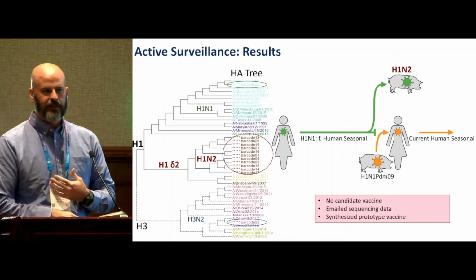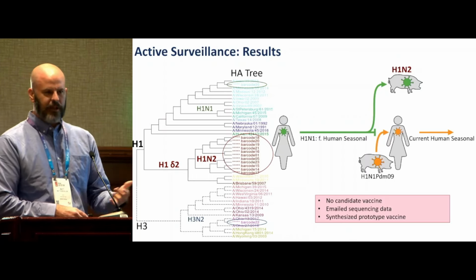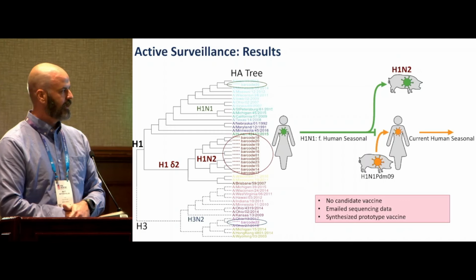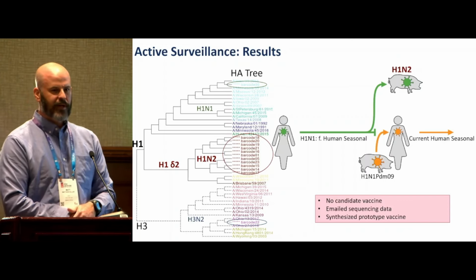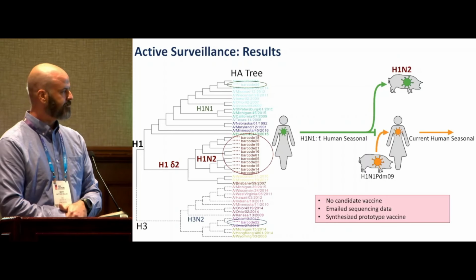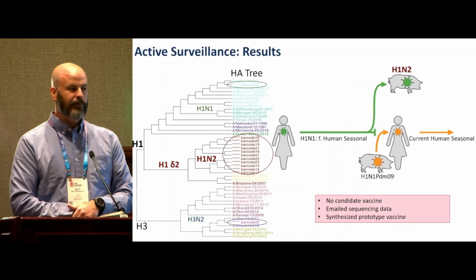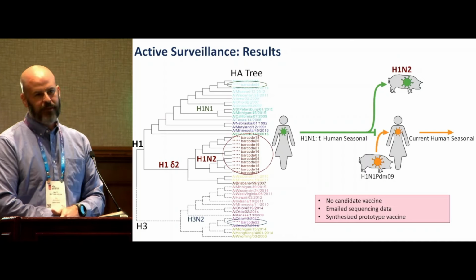Now that virus got displaced out of humans by the 2009 pandemic, but it didn't go extinct. It actually jumped back into pigs and circulated there, accumulating mutations and evolving and moving further and further away from the old vaccine. So we saw this virus that hasn't been circulating in people in a while. There are a lot of kids at this show, and it was a poor match for the nearest vaccine. So we emailed some Nanopore data back to our colleagues at CDC who began synthesizing a prototype vaccine. And that email took place about 16 hours after we opened the cases and set up and started work. This virus actually ended up jumping into people. We detected it a few months later through our routine surveillance efforts, and that vaccine has now been upgraded to an official pre-pandemic vaccine that's in the freezer at WHO somewhere.